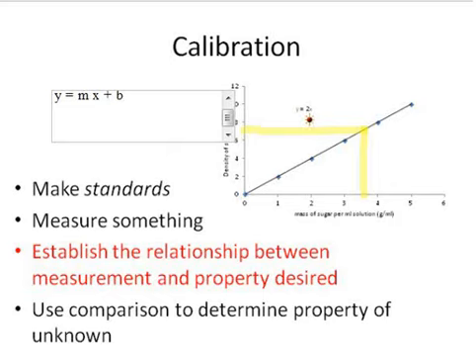So you should be able to algebraically rearrange the expression for x equals something in terms of y, m, and b. If you're having trouble with that, ask your TA for help. But you should be able to get a mathematical version of the answer as well as this graphical version of the answer, and those two answers should be almost identical, so they should give you the same answer. And that's a nice way to confirm that you did everything right.